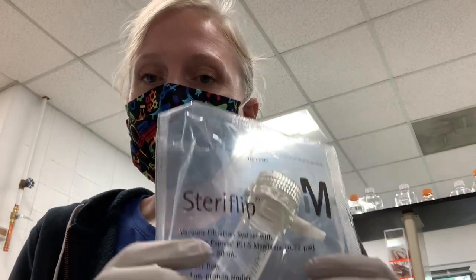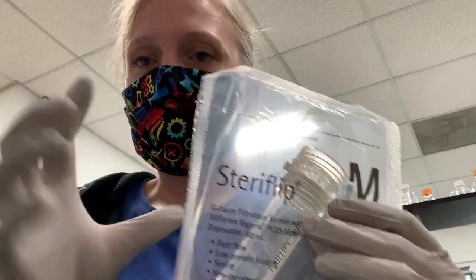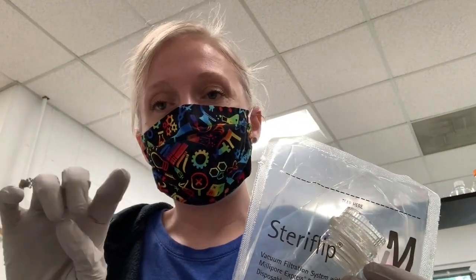So earlier I made a 5 molar ammonium acetate solution and talked you through that. And now I'm going to use sterile filtration to sterilize that solution. So there are 2 ways to sterilize solutions. One is to use a filter system. So we have these Steri-Flips. We also have big bottles that have a sterile filter in it.